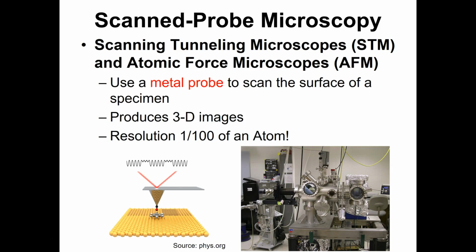And while they probably seem incredibly daunting, they actually work on a principle that's incredibly relatable. Most of you folks probably know what vinyl records are. You're like, Why is he talking about vinyl records in a microbiology class? Because these work just like vinyl record players. So, with a vinyl record, you have a record that has grooves with little bumps in them.